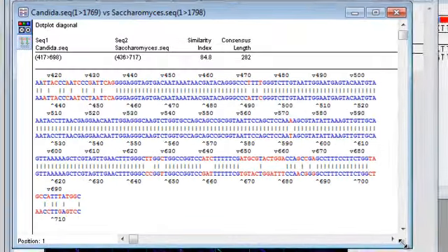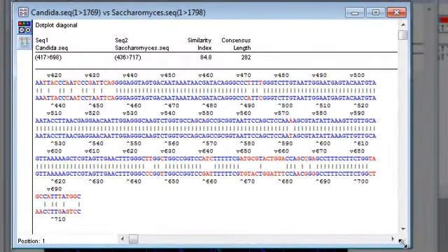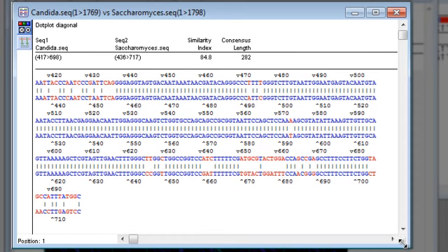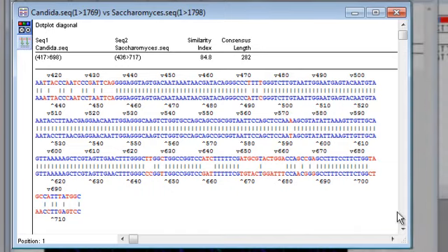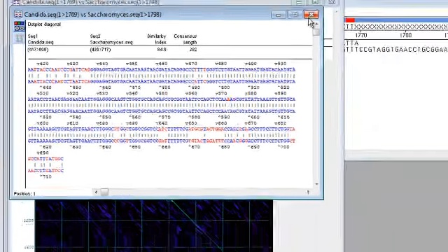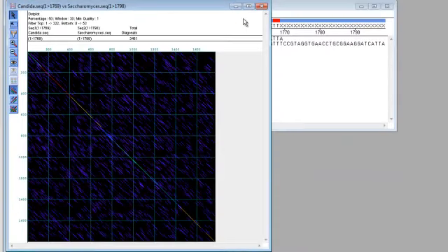And here you can see that these sequences align pretty well in this region, as indicated by the blue matching bases, with a few mismatches as shown in red. So this explains the relatively high alignment score and the yellow color of the diagonal line.